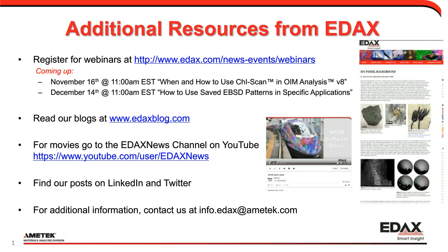The one that was a little bit more of a challenge was the grape seed. That was higher pressure than I normally use, about the highest pressure, I think about 60 pascals, but we're still able to get nice looking images and good signal, all with just the variable pressure of the scope. No need for that. Oh, thanks, Dave.